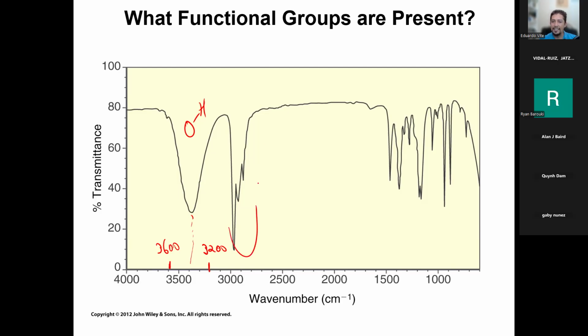So in this case, this is the only case where it is acceptable to just say CH stretch. Why? Because we have no formula and we have no actual structure of anything, right? So the only thing we know is that these are some sort of CH stretches. And that would be okay in this case because we have nothing else to go off of.